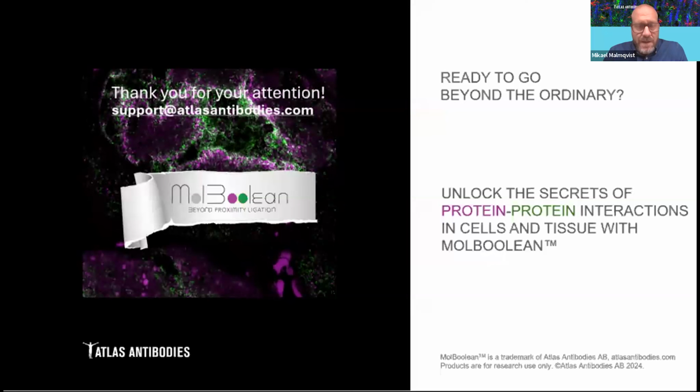Okay, so this is an interesting question. Does one need to know beforehand, before using MolBoolean, that the individual primary antibodies will work for basic PLA, i.e. that the epitopes recognized by the primary antibodies are not masked when the two proteins interact? When we select antibodies, we usually buy several antibodies for every protein, and then we try to see how well they bind.